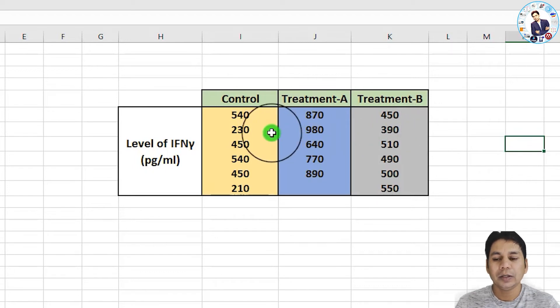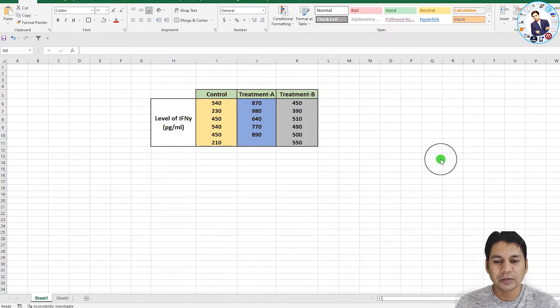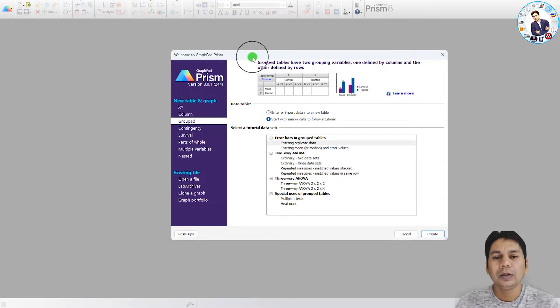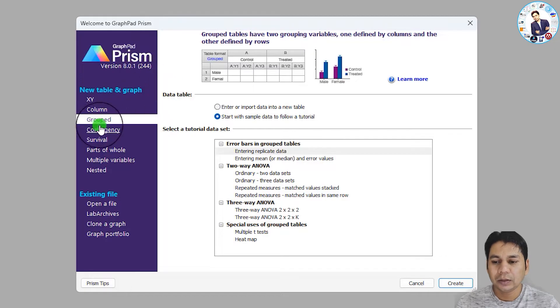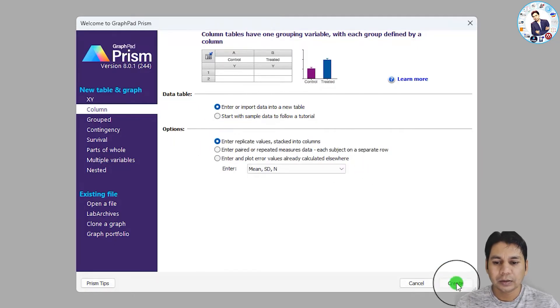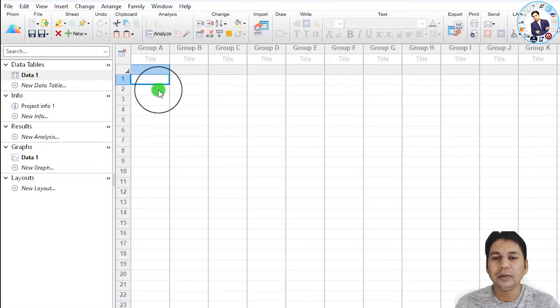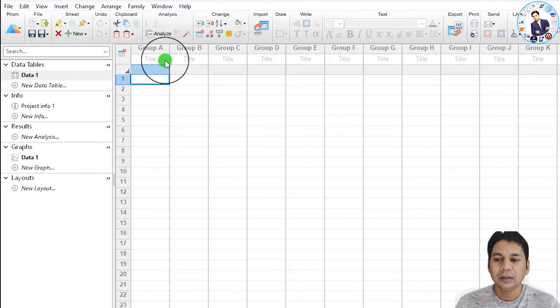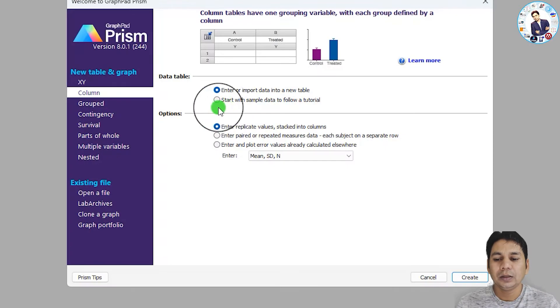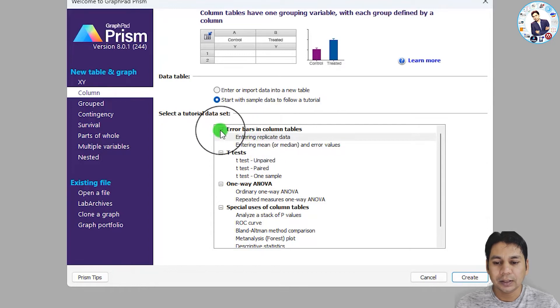To perform a one-way ANOVA test using GraphPad Prism software, open the software. In the column panel, you can click on 'Enter or Import Data in a New Table' and click 'Create' to open the panel where you can put your data in respective groups. Alternatively, click on 'Start with Sample Data to Follow a Tutorial'.